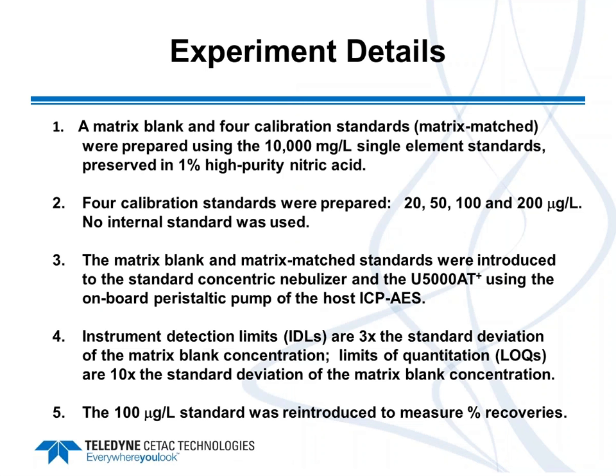water matrix. These solutions were introduced both to the standard concentric nebulizer and to the ultrasonic nebulizer, the U5000AT+, using the onboard peristaltic pump of the host ICP. Instrument detection limits, or IDLs, were defined as 3 times the standard deviation of the matrix blank concentration, and that again is the very hard water matrix. Limits of quantitation, or LOQs, were 10 times the standard deviation of that matrix blank concentration, and we read back one of the middle standards, the 100 ppb standard, to measure percent recoveries.